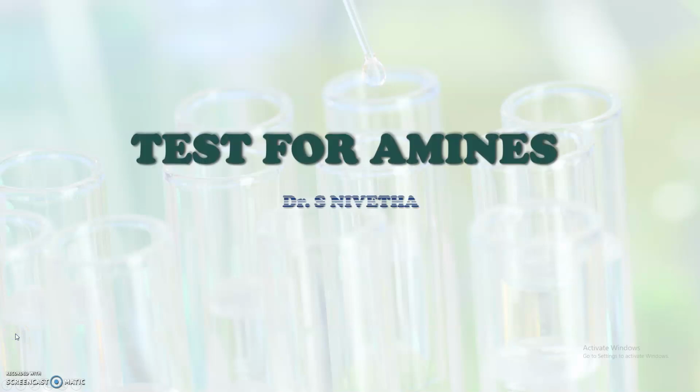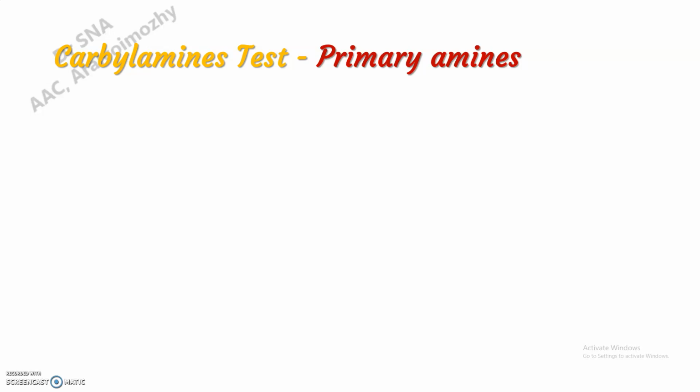Let us identify amines. Here, first test, carbylamine test. So this is a common test to identify primary amines.